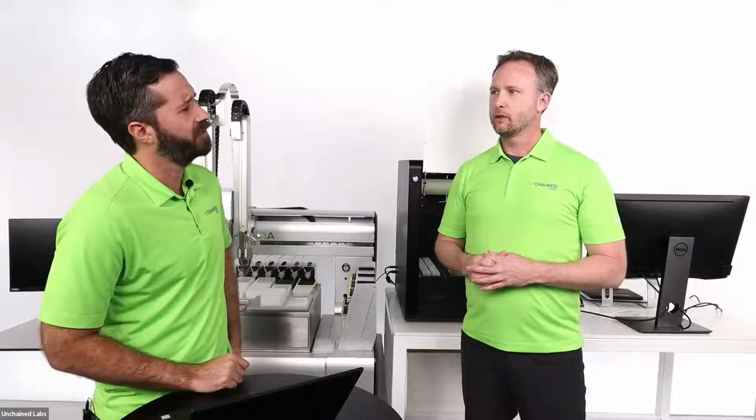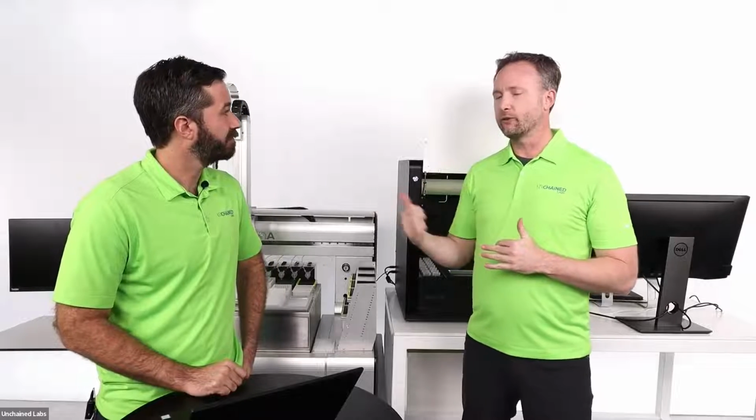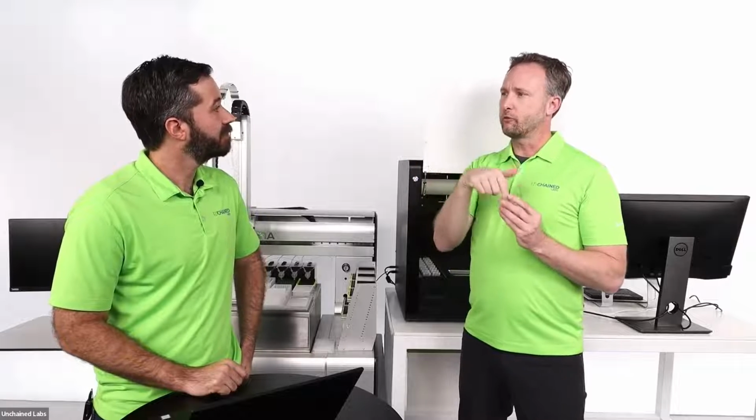All right. We've got another question here. How is dilute and filter used? Oh, somebody was paying close attention. I didn't go into it for the sake of time today, but that is a feature on both instruments where the system will do a dilution for you.